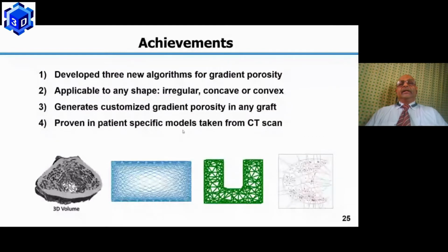And just to recollect, there is a hard tissue here, which has a longer degrading time, provides structural stability and some degree of mechanical strength, and there is a soft tissue. So both hard plus soft tissue are modeled by a scaffold in here and provide a high degree of regenerative growth in the lab. We are now going to test this in a preclinical model, and then see how well it works there in order to apply for drug controller permission for a human trial.